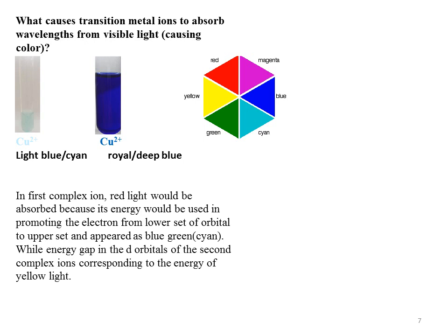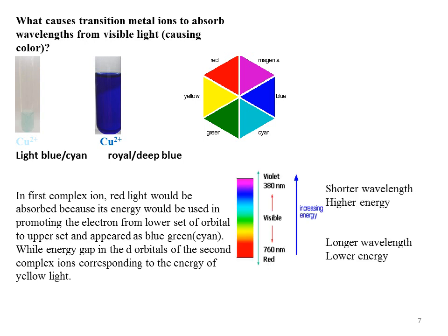Yellow light photons जो हैं यहाँ पर एब्जॉर्ब होंगे और हमें blue light as transmitted light ऑब्जर्व हो रही है. When we talk about the visible spectrum, so जो red spectral part है that is longer in wavelength and lower energy, while its blue or blue violet part जो होता है that is of higher energy and shorter wavelength.